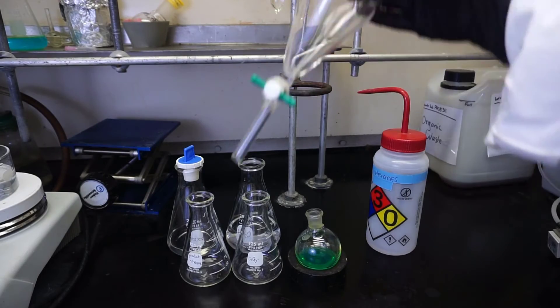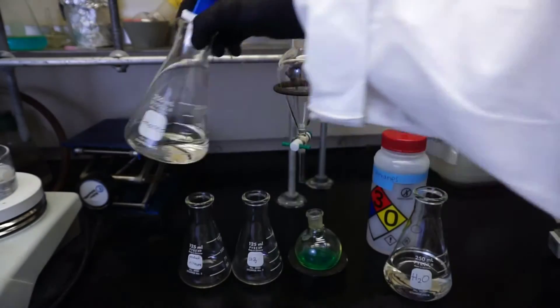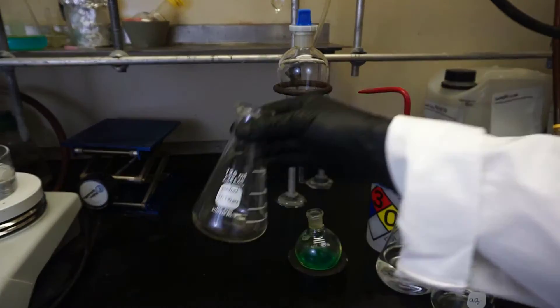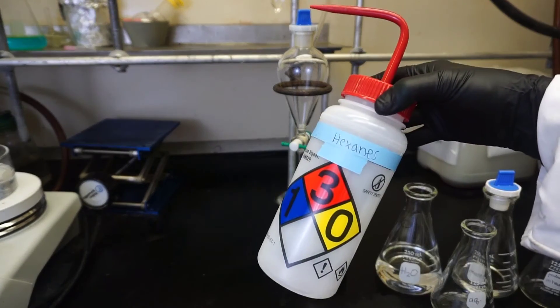Now that we know what we're going to be doing, let's head to lab and see what this looks like. To get started with our extraction we're going to need a few things: first is PPE — goggles, gloves, and a lab coat. We're also going to need a fume hood, because the organic solvent we're going to be using is quite volatile and we want to make sure we don't inhale any of it. We'll need our separatory funnel, a flask with water, a flask with our organic solvent — hexanes, a flask for the aqueous layer, a flask for the organic layer, our reaction mixture, and a squirt bottle with hexanes.